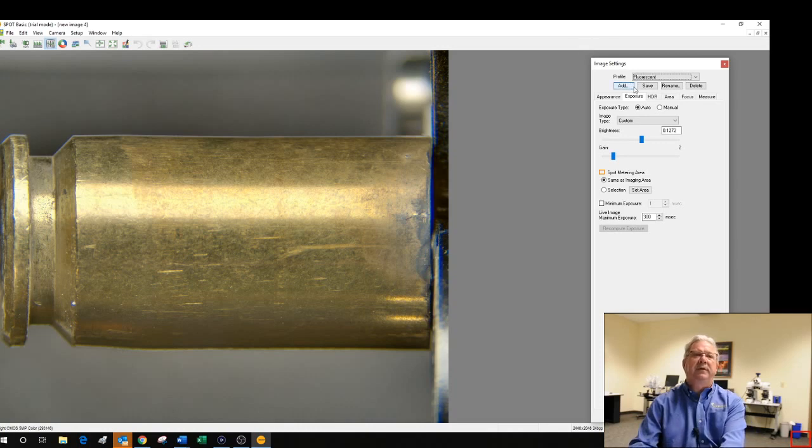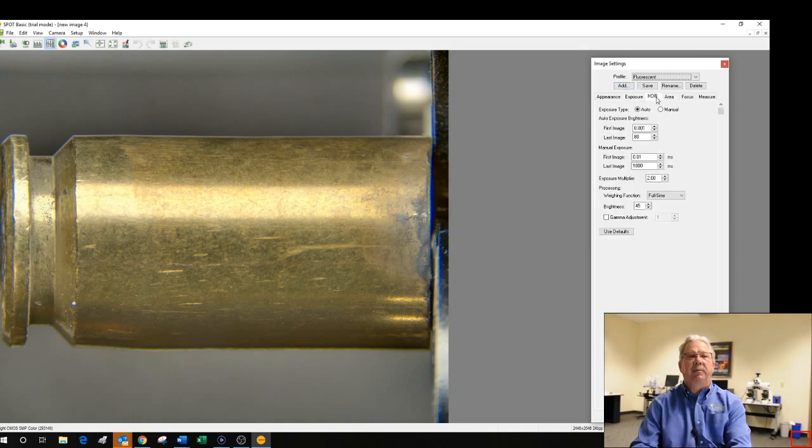There's a very sophisticated menu that we can pull up here with things to adjust and play with, and you can change those settings and see if you can improve on the type of imaging that we have created here. But in most cases, I think you're going to find that it's just a magic button. You just press it and boom, it gives you a good image.